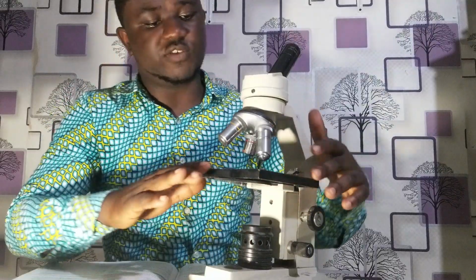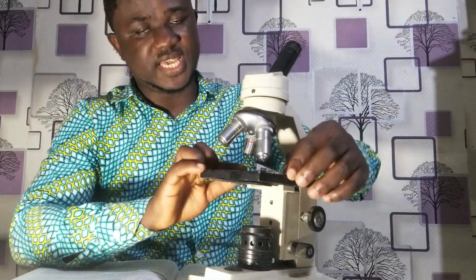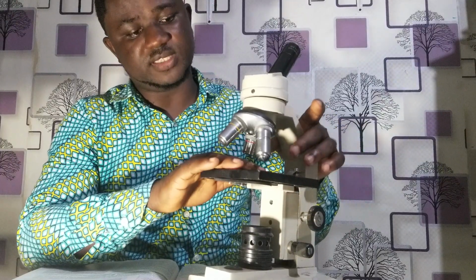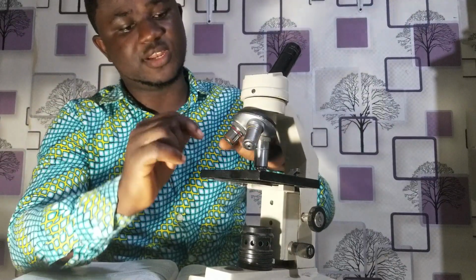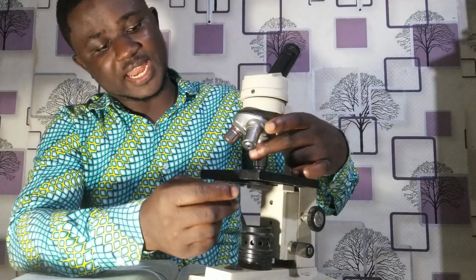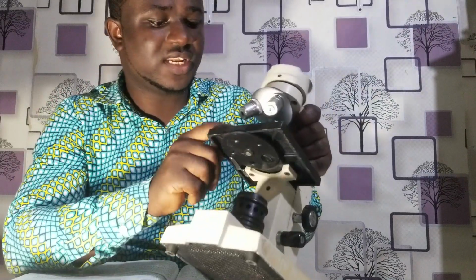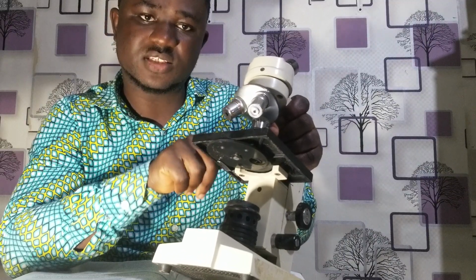This is the stage of the microscope. So the specimen is actually placed on this stage. Then the objective lens looks directly at the specimen placed on the stage. Then beneath the stage, you have the diaphragm, which is used to control how much light would enter the condenser lens. And note that the condenser lens is just right at the stage.